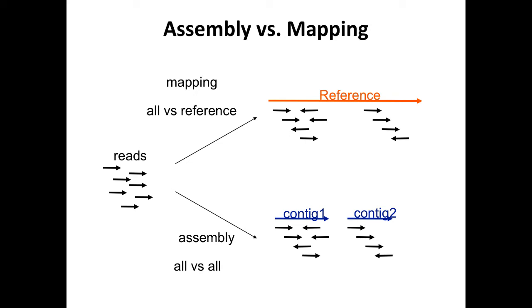Some parts are missing, some parts are wrong, that could influence the location of your read. So in most of the cases, the best location will correspond to the true location, but sometimes in tricky regions, the best location is not the real location of your read on this real, own genome. So it's why I say mapping is the way to find the best location.